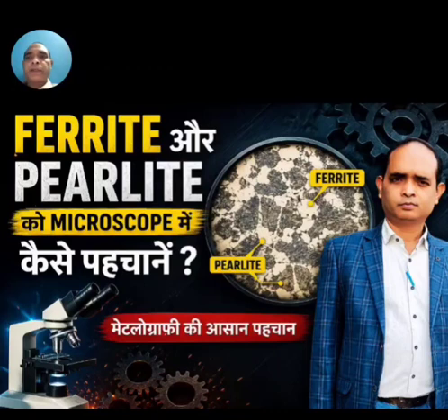Its mechanical properties depend largely on its microstructure. The two most common microstructural constituents found in plain carbon steel are ferrite and pearlite. These structures are too small to be seen with the naked eye. Therefore, we use an optical microscope after preparing and etching the specimen. Understanding these microstructures helps engineers determine the strength, hardness, ductility, machinability, and overall quality of steel.